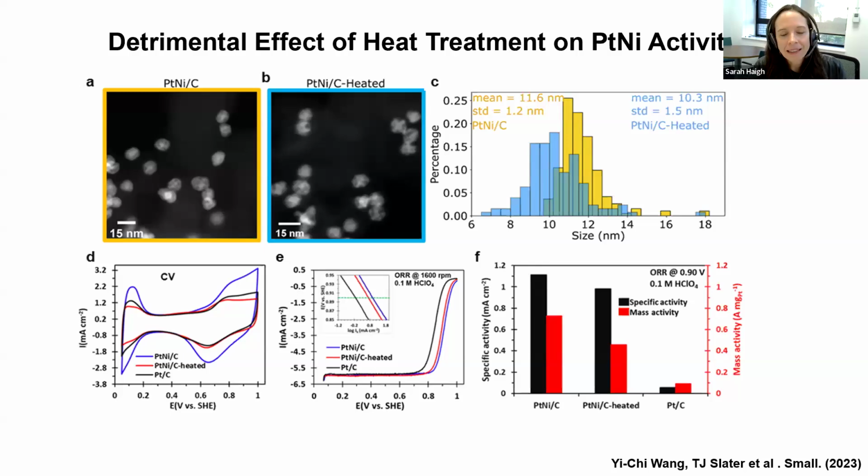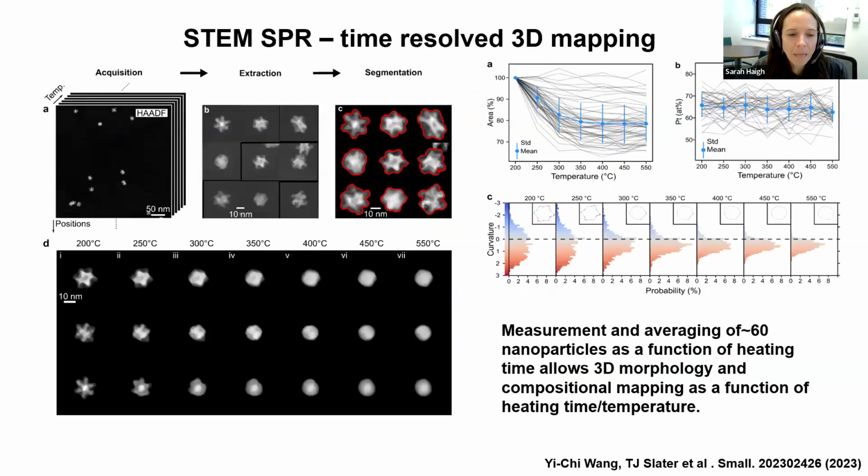And we can't yet look at atomic resolution in 3-dimensional at platinum nickel catalysts inside a fuel cell. But we thought, well, can we try and see whether this 3-dimensional single particle reconstruction approach for inorganic nanoparticles could be applicable to in situ data? And this slide is just highlighting that change in structure, but also the reduction in activity after use for a very extended period of time.